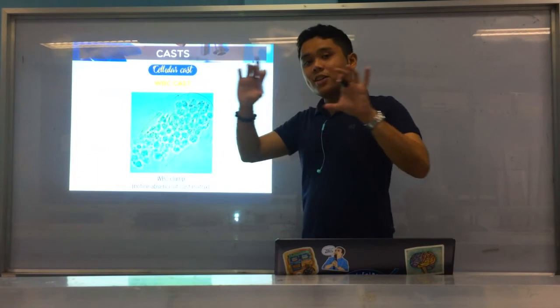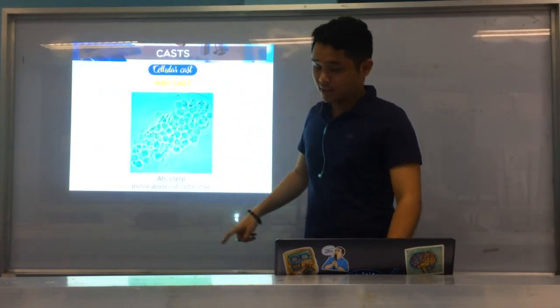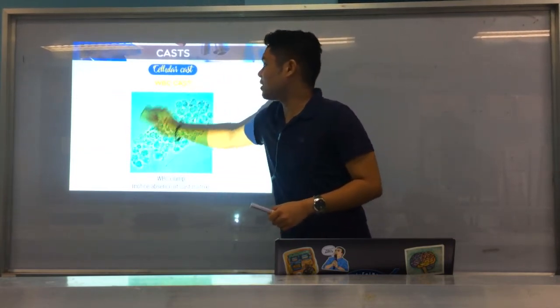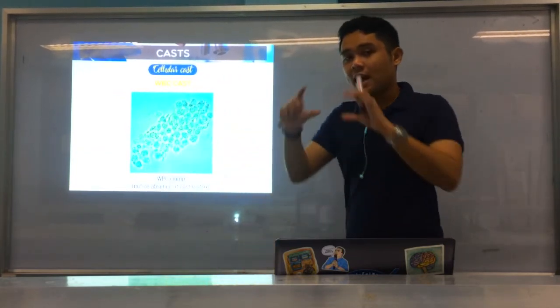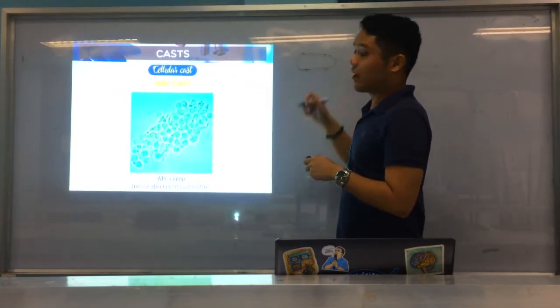Di kayo klaro iyang shape, di ba? So, kumpul-kumpul na siya. Okay, and this could be an identification error for WBC cast. Basta gani, maglibog mo if cast ba na siya or dili. Always look if naa ba siya katong shape na to. Parallel sides, rounded ends. Okay?